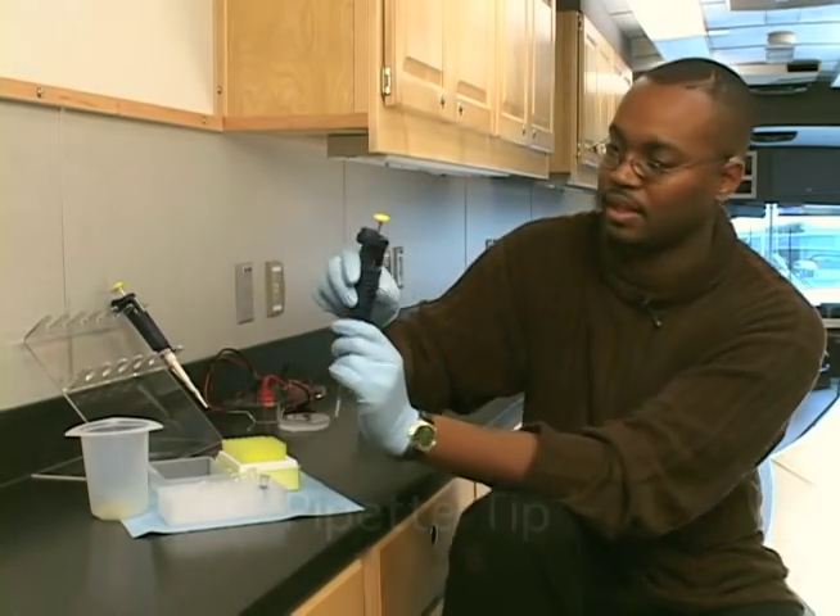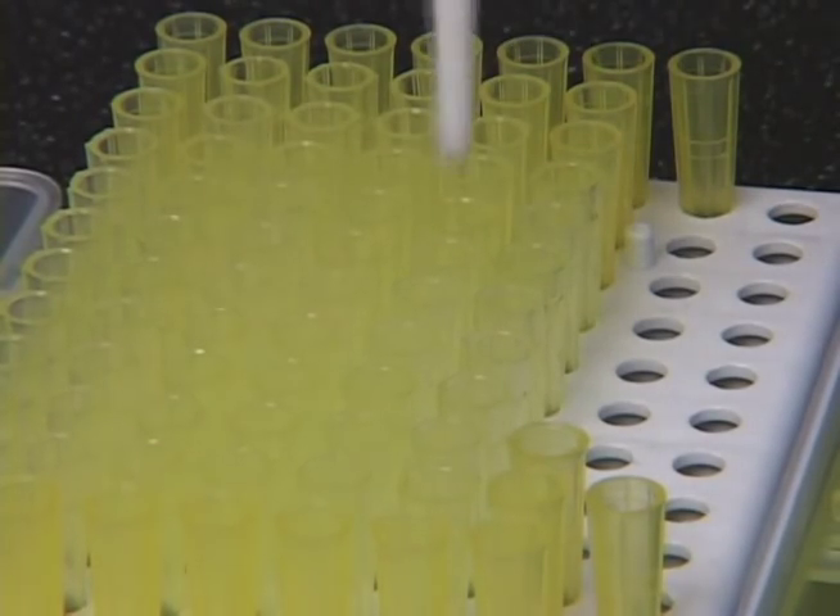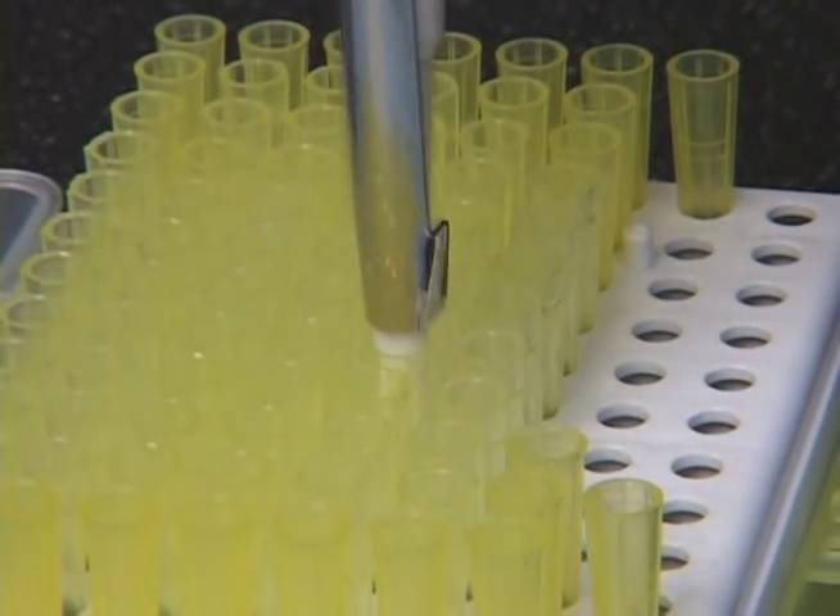First, let me put the pipette tip on the pipette to show you how that works. I'm going to press down into the opening of the pipette tip. When you pull your pipette up, you have your pipette tip connected to your pipette.